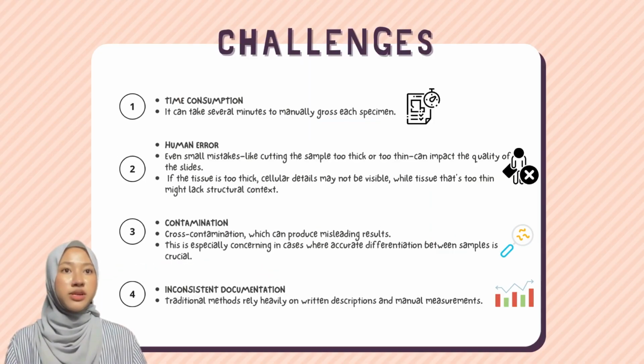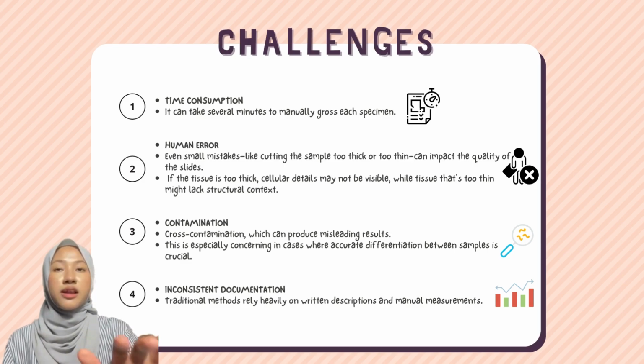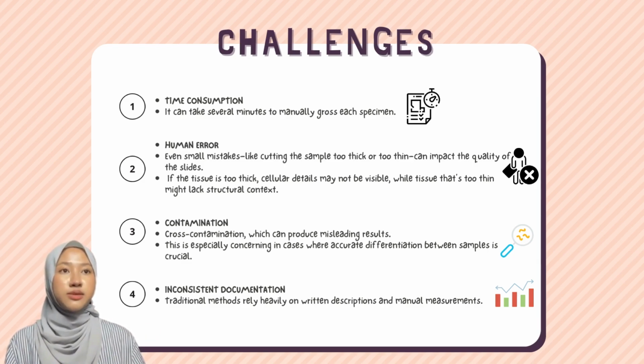One of the primary challenges with this traditional method is time consumption. On average, it can take several minutes to manually gross each specimen, especially for larger or more complex samples. These delays can ultimately slow down diagnosis, which is especially problematic for critical cases.